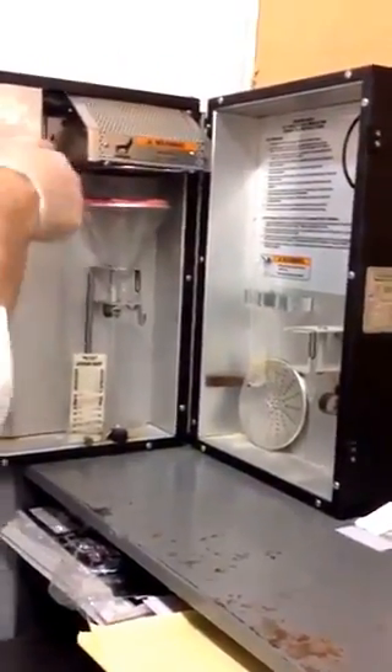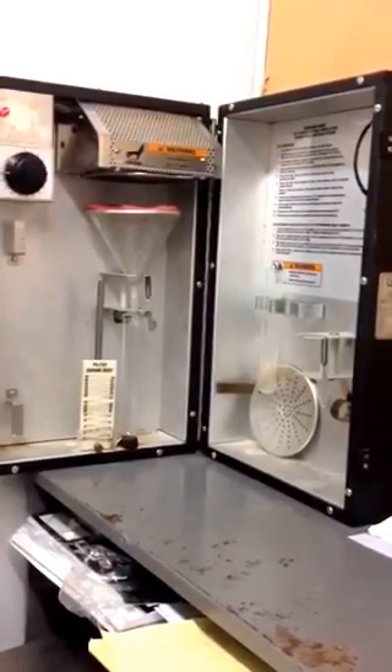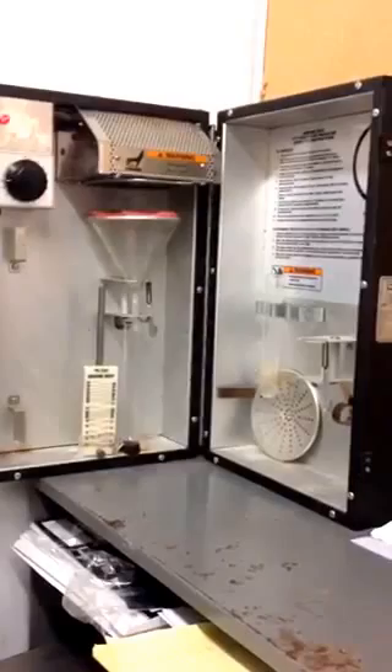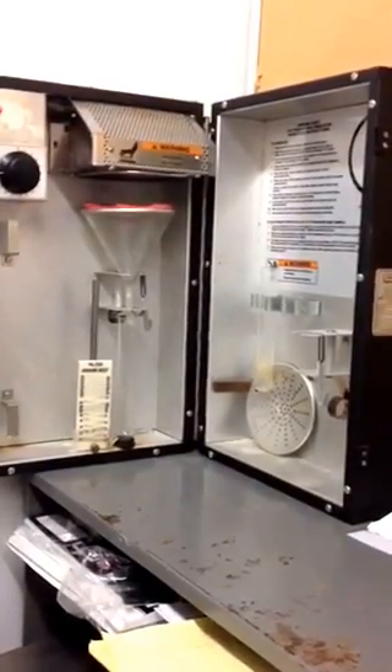We turn it on to the end, which is about 15 minutes, and we let it cook. As it cooks, it drips the fat and the water and all that down into the test tube.